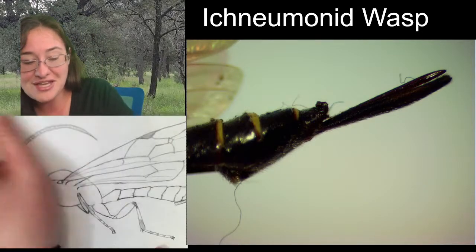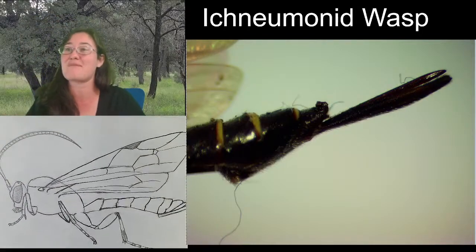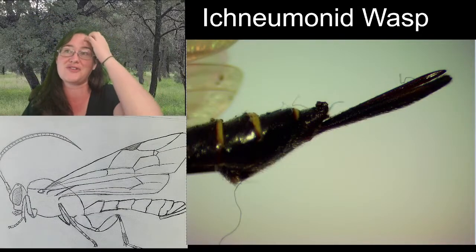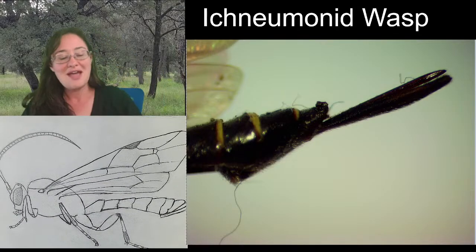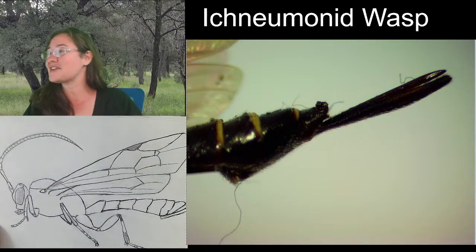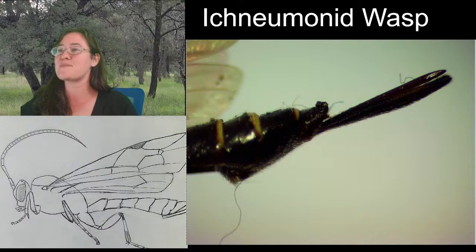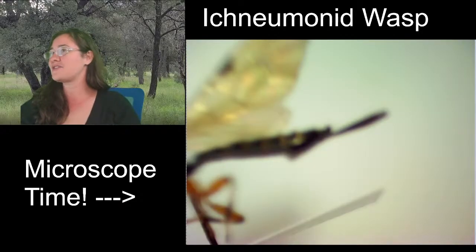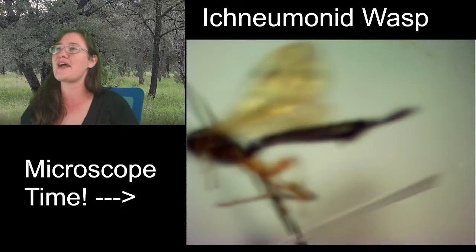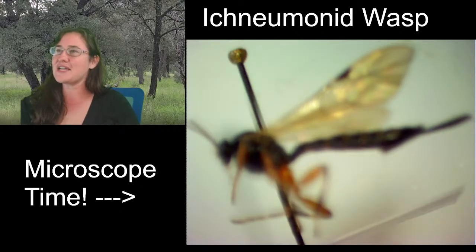We are closing in on it being fall/winter, and so I might be picking up the Guess That Bug again, where I take microscope pictures and post them on Instagram. I think that'll be a lot of fun. All right, so that is our ichneumonid. Yay! I'm happy that we got to go ahead and look at it. I'm going to zoom out our friend here so that we get one last view of it in its entirety.